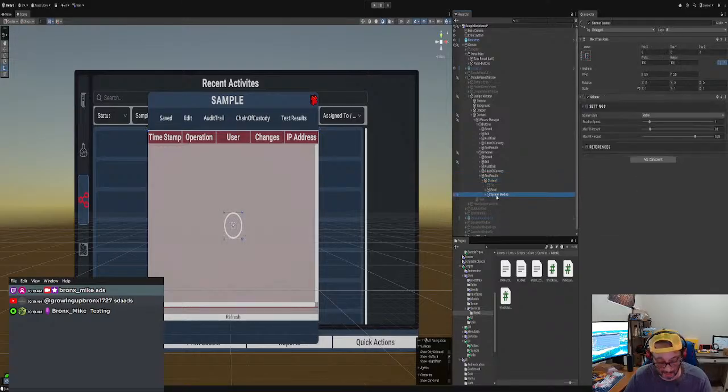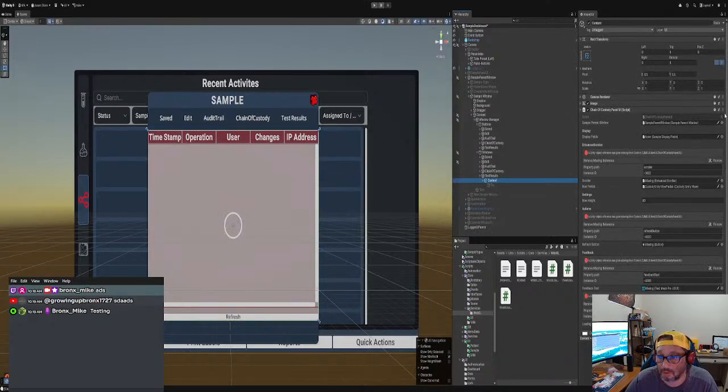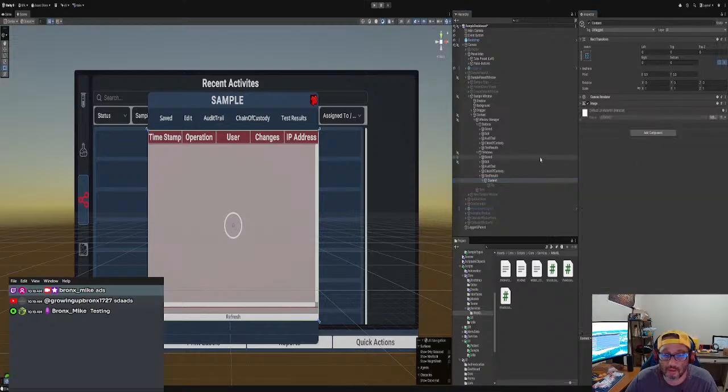You want to get rid of this. We're going to do it like we were actually going to do it, build it ourselves. All right, so we have the test panel script. Let me show you here. Let me see test results.